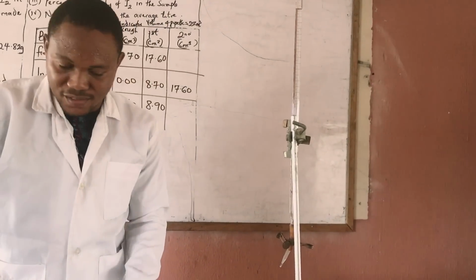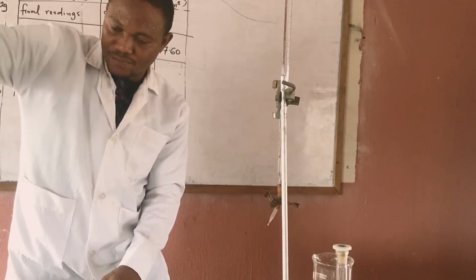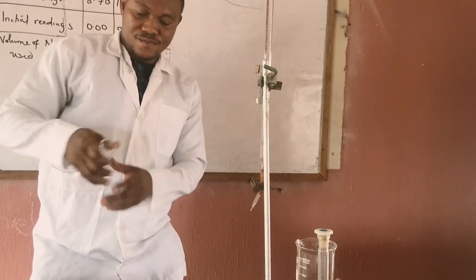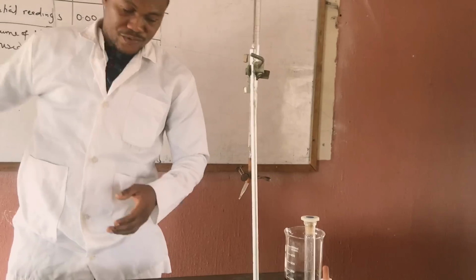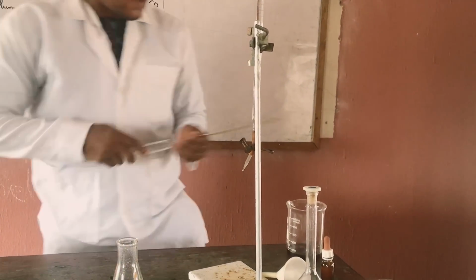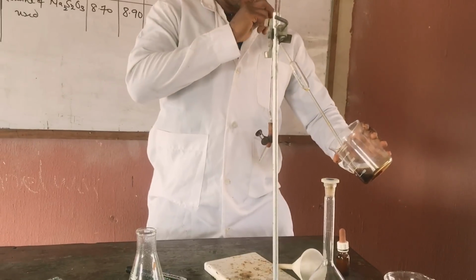Let me dispose this. Okay, try to swirl so that we have everything. So this will be the last titration before the calculation.